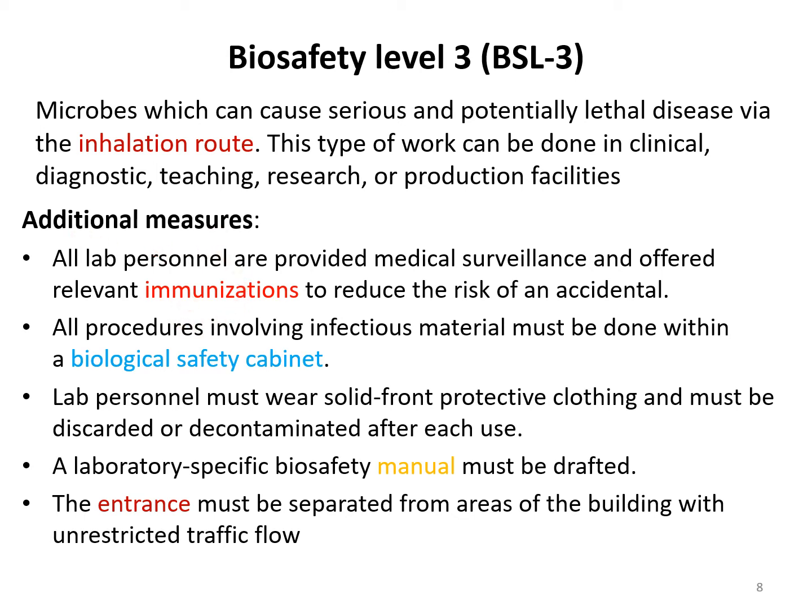All lab personnel are provided medical surveillance and offered the relevant immunization, of course, to reduce the risk of any accident. All procedures involving infectious materials must be done within biological safety cabinets. So there is a restriction. Definitely for the pathogens we deal with in BSL-3, we must use a biosafety cabinet.